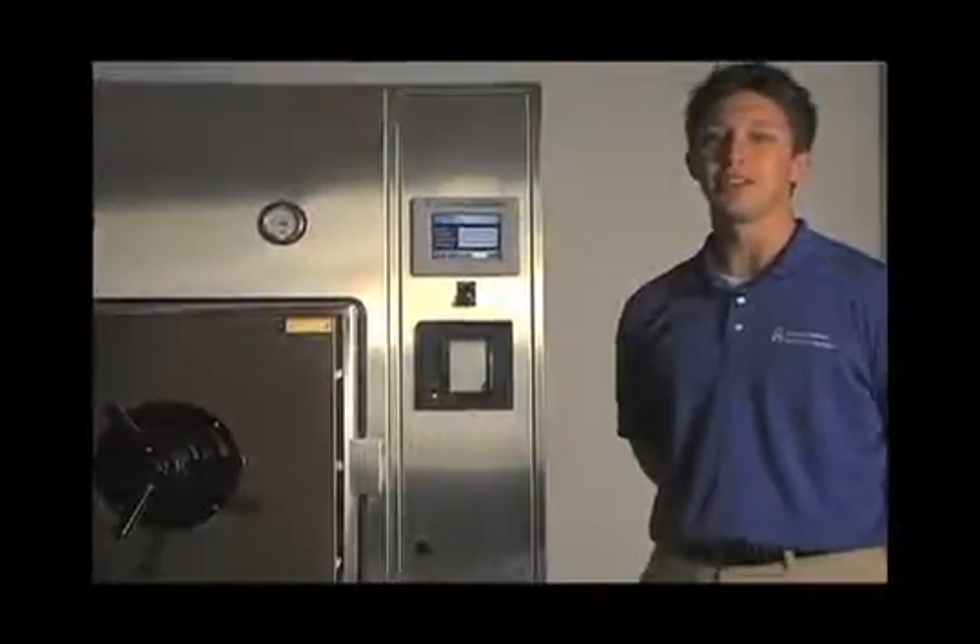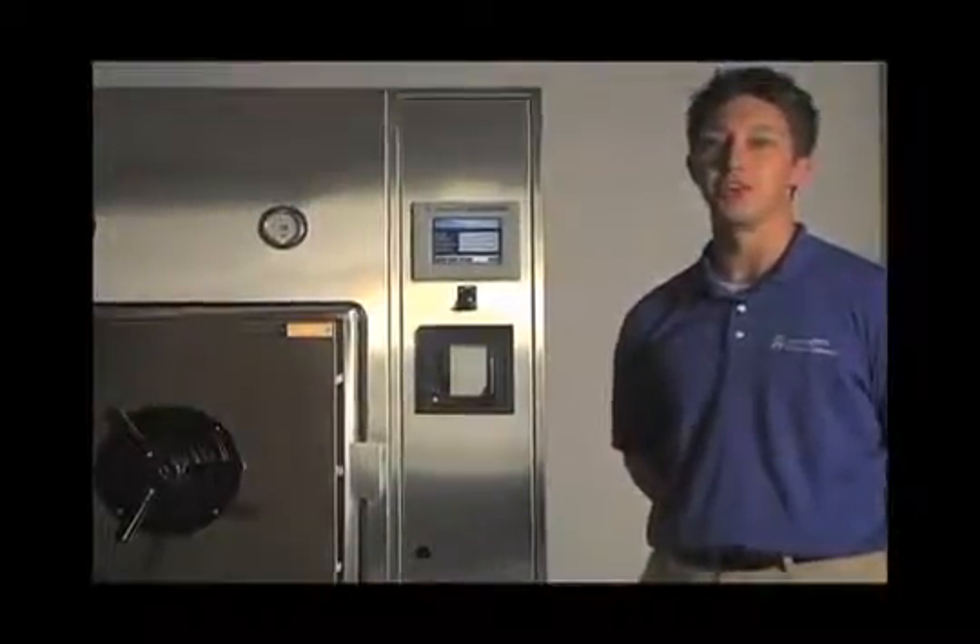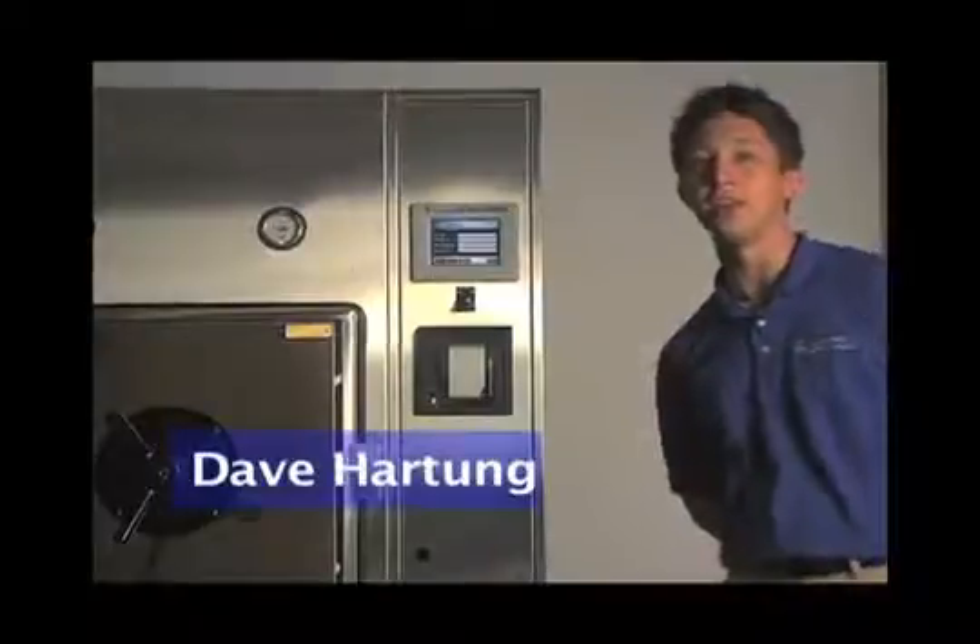Welcome to Consolidated Sterilizer Systems instructional video series. My name is Dave Hartung and in this video I'll be showing you how to change the printer paper in the Advantage Pro Controller thermal printer.